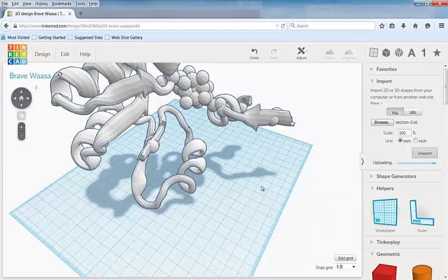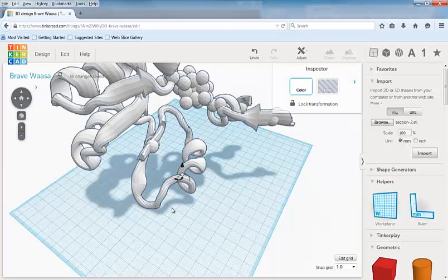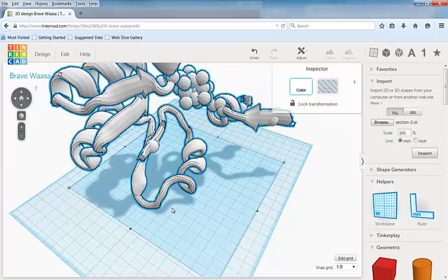We're going to have to wait for that for a second. Once that brings it in, we actually have to put all these different sections over top of each other, overlay and do some merges, which aren't too difficult to do. You do have to kind of get used to doing that. But once you have it all merged and you make your cleanup cuts and stuff like that, then we can kind of orient this afterwards.